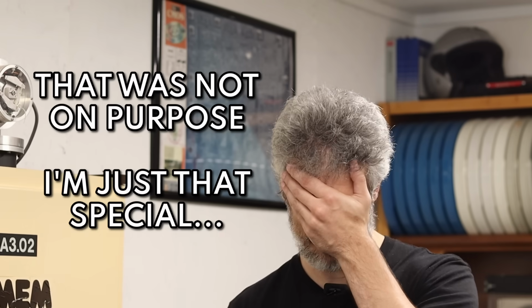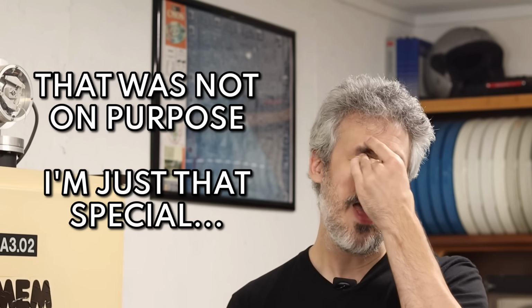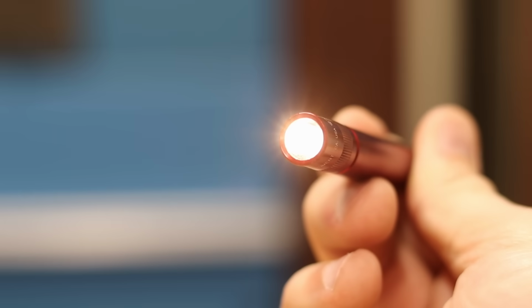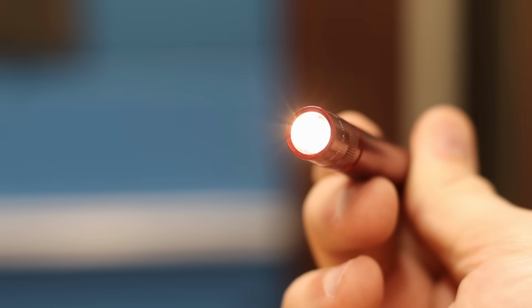Now this is like a terrible spectrometer for a multitude of reasons, but one of them is that we don't actually know a whole lot about our light source here. Is it really white? I mean, when I shined it in my eyes, it looks a little blinding, but also yellow. So maybe it's not a pure white.